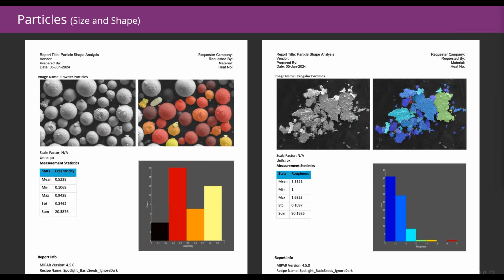perimeter concavity and complexity. So think of a starfish as an example of a very rough object, with an object that represents a perfect circle as having very low roughness. And we see that plotted here and visualized.